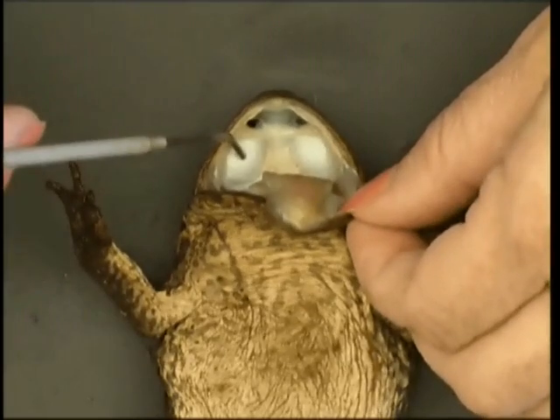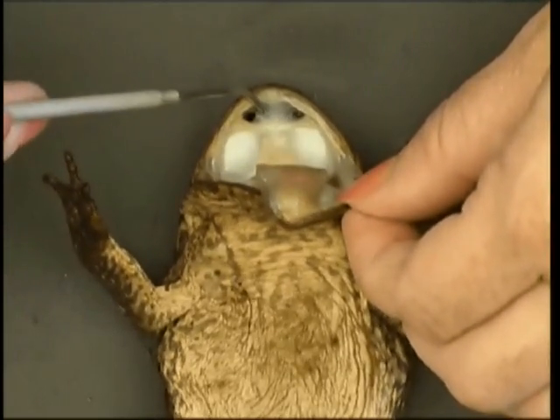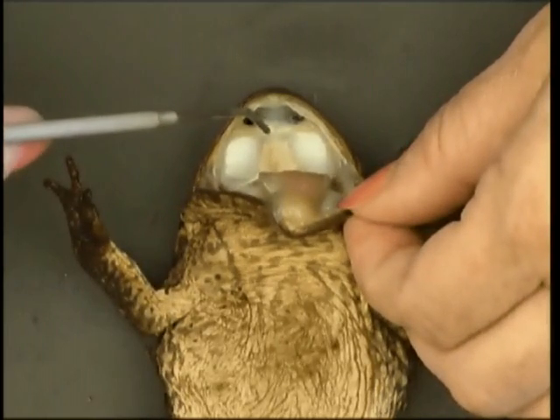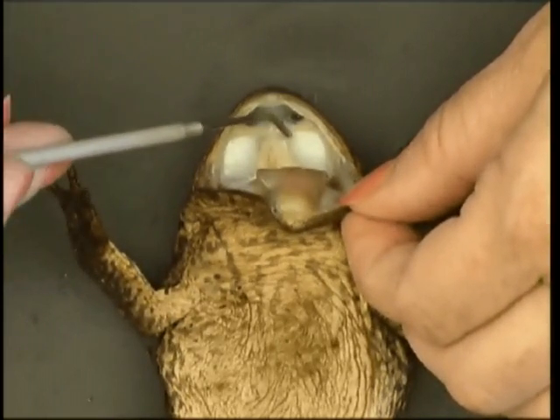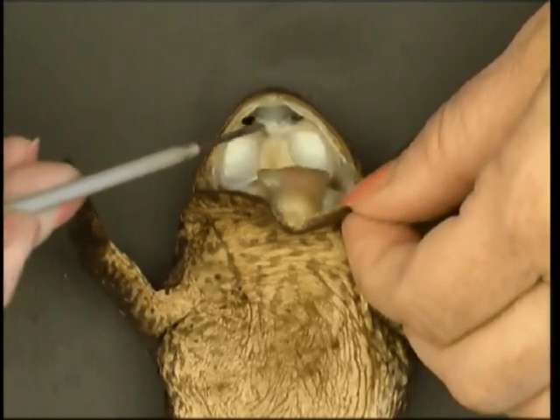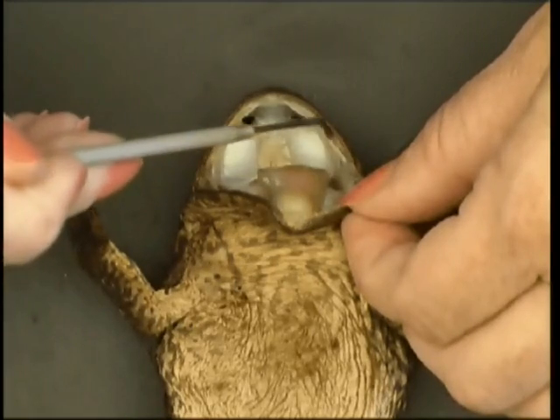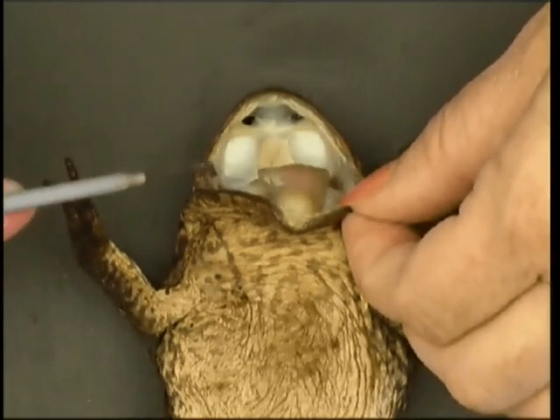Down here you can see the eyeballs — there's no protection, so they actually push those down to push the prey down into their mouth. Sometimes they'll have small teeth across here, which is the vomer, and some very fine teeth on the maxilla and pre-maxilla around the top.